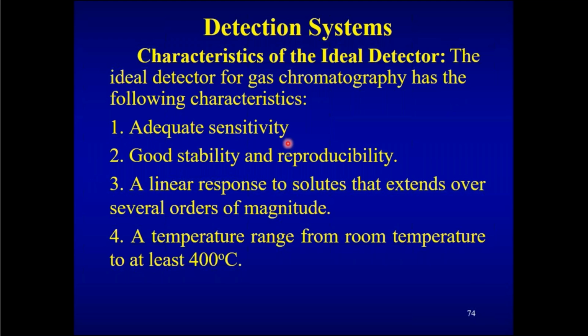It should have adequate sensitivity. Now, most of the detectors that I just named in the previous slide show a sensitivity of roughly around 10 raised to minus 8 gram solute to about 10 raised to minus 15 grams. So that low quantity of solute can be easily detected by all these four detectors that I mentioned. Some of them are still very high, because 10 raised to minus 15 refers to femtograms. So that's a very small quantity. So the sensitivity of these detectors is very high.